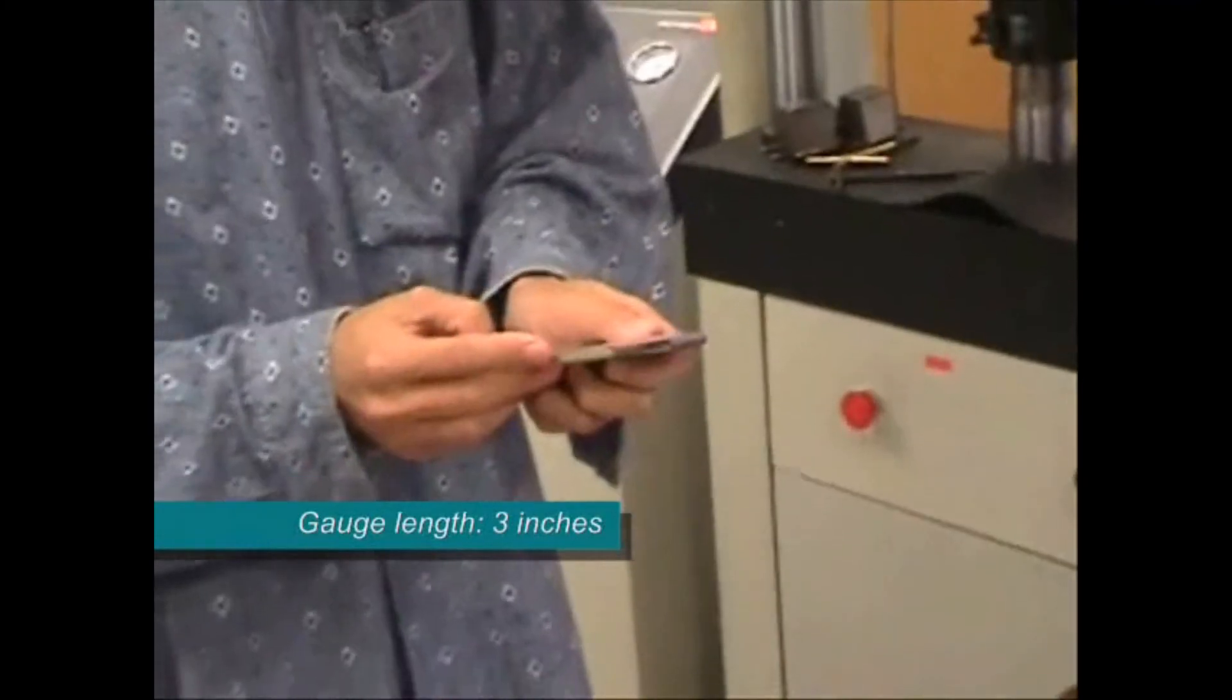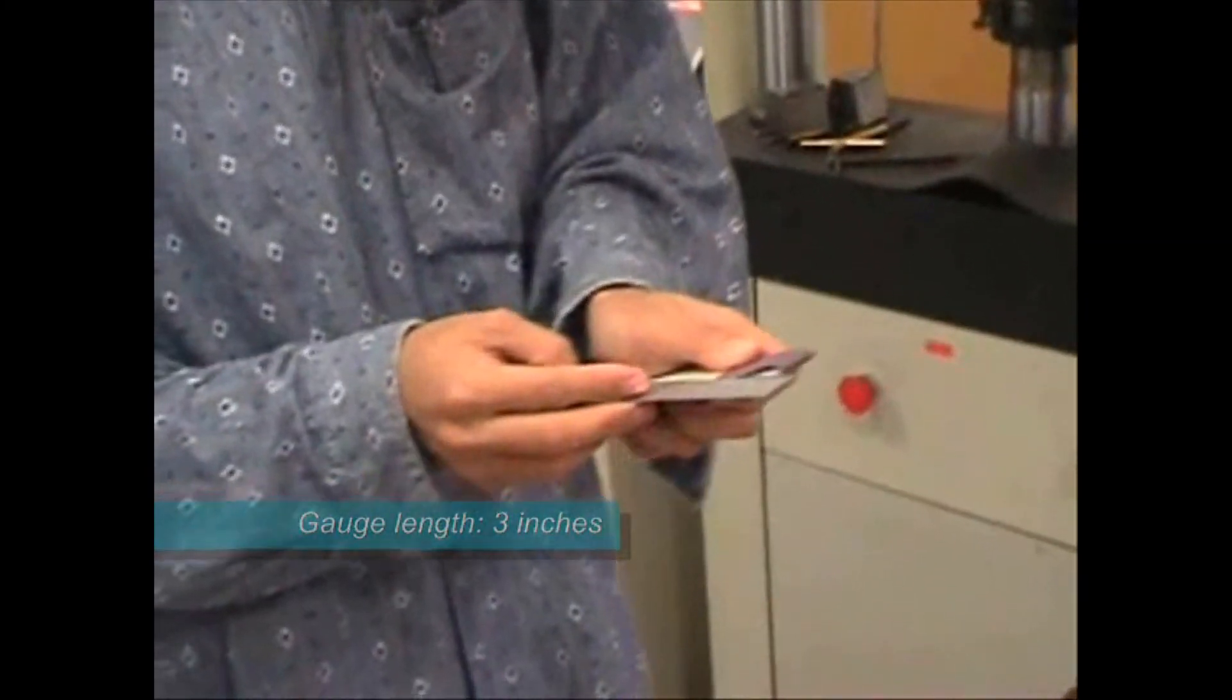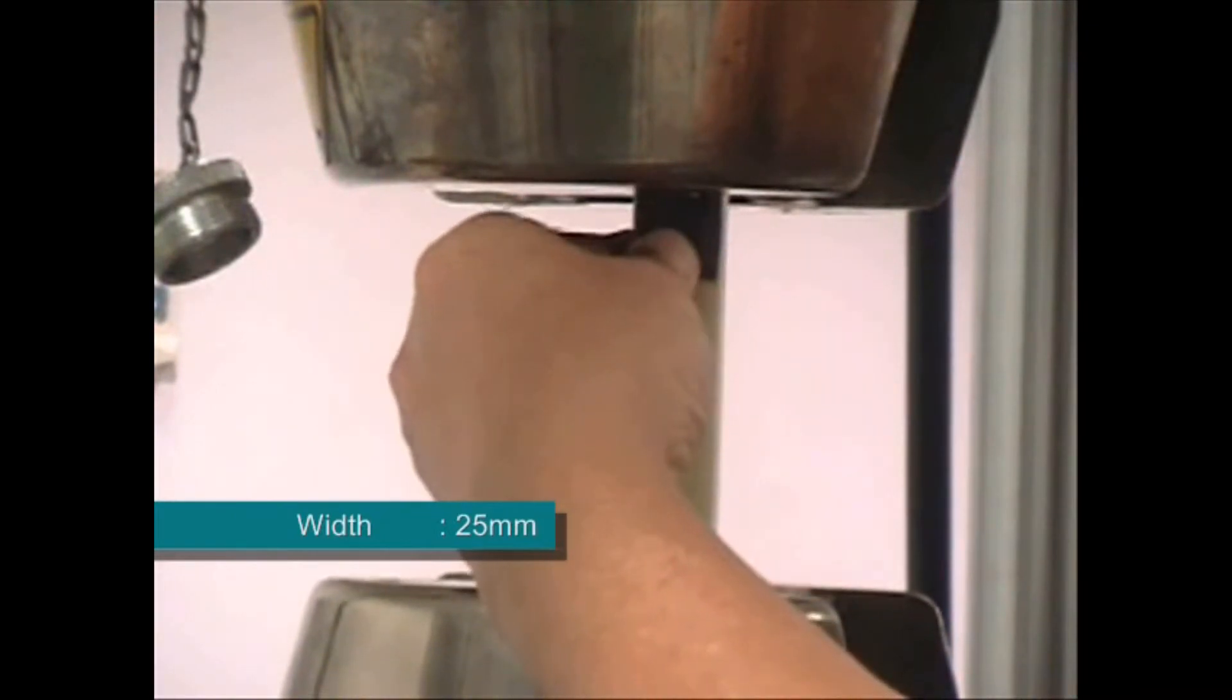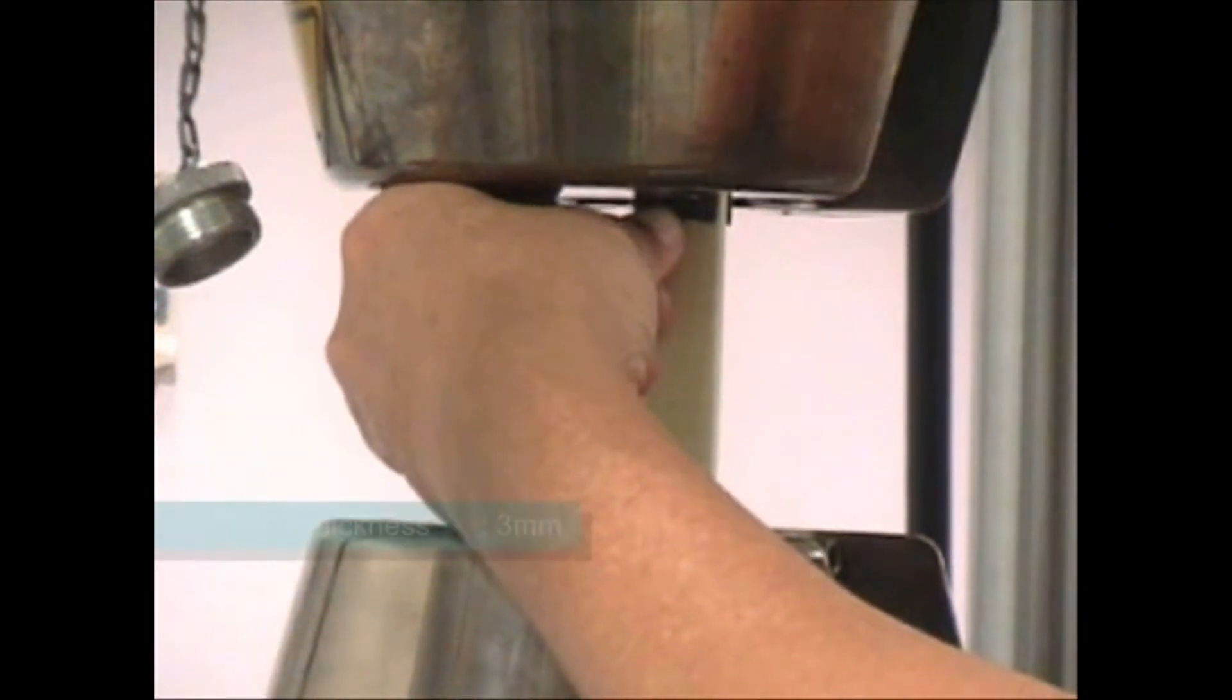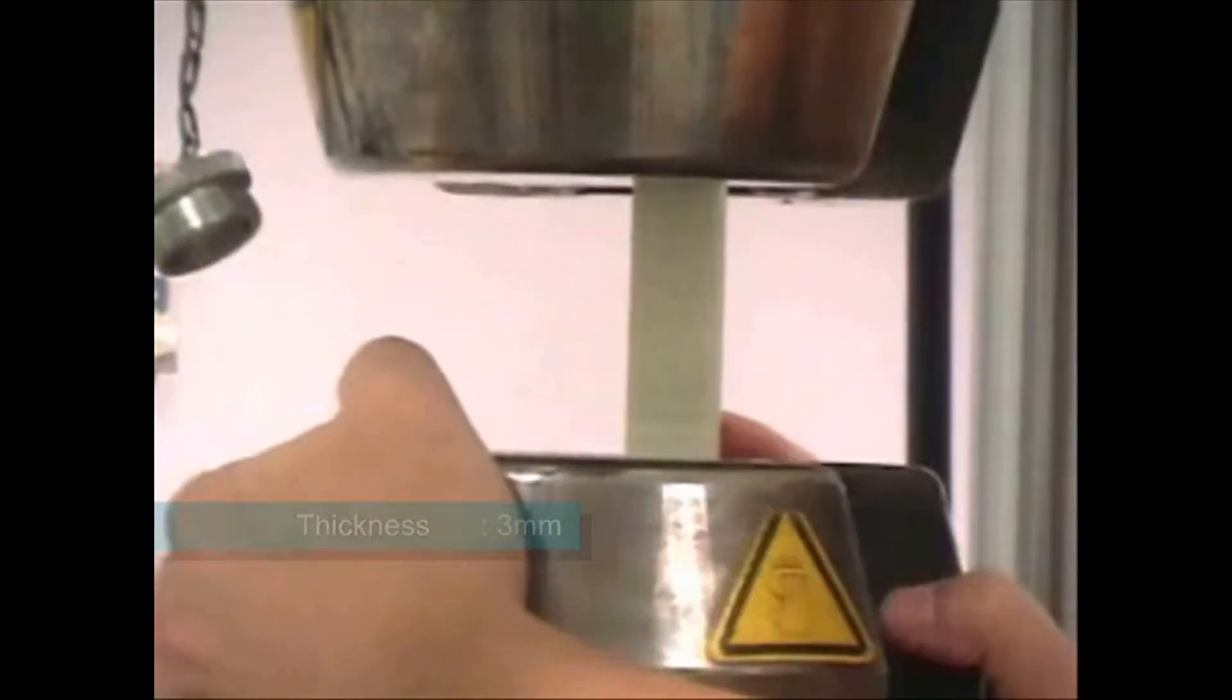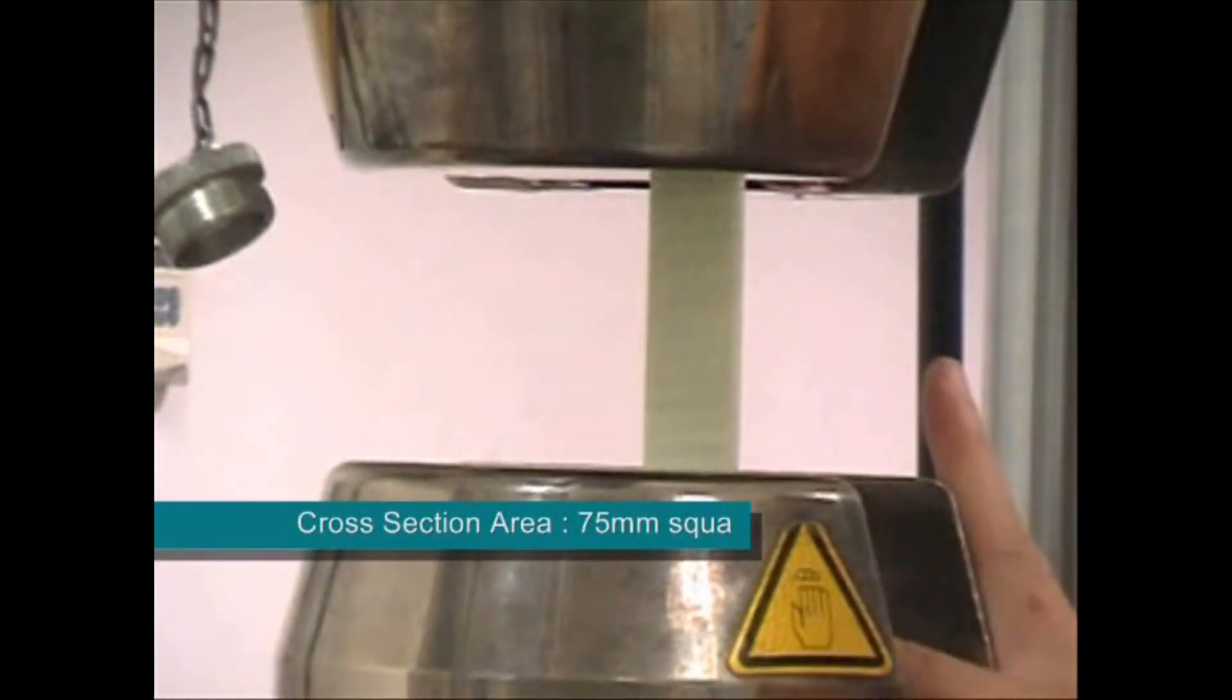The grip is basically emery paper or abrasive paper. Abrasive paper will help to grip the specimen very firmly, because in this kind of specimen it is possible that the specimen will slip from the grip.